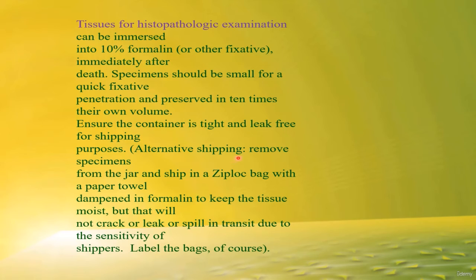Alternatively, remove the specimen from the jar and ship in a poly bag with paper towel dampened in formalin to keep the tissue moist, but that will not crack or leak or spill in transit due to the sensitivity of the shipper. Label the bag of course.